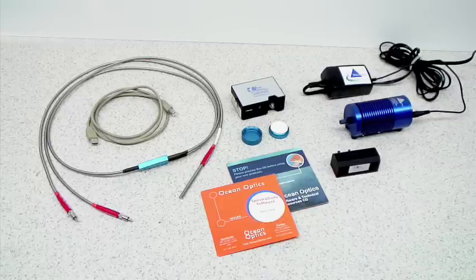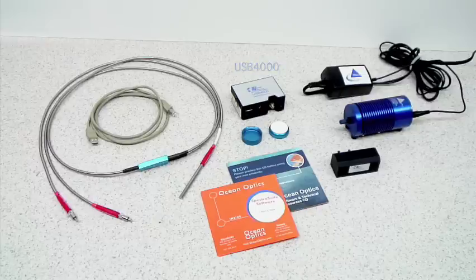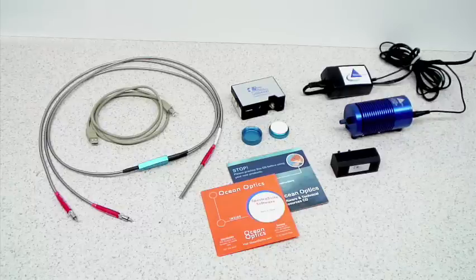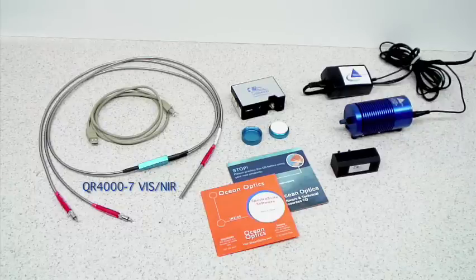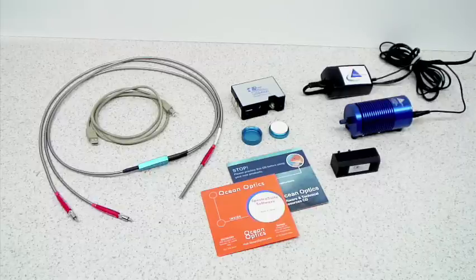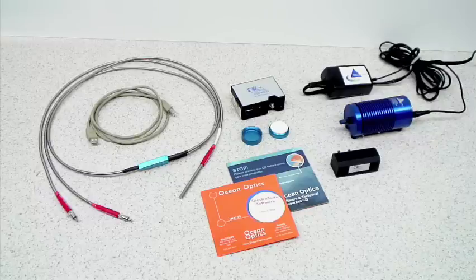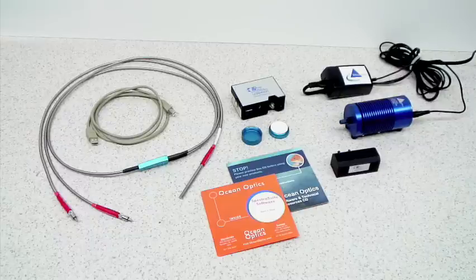In this demonstration, we will be using a USB 4000 spectrometer, an HL2000HP tungsten halogen light source, a QR 4000-7 VisNIR reflection probe, a WS1 PTFE diffuse reflection standard, and an RPH1 reflection probe holder.